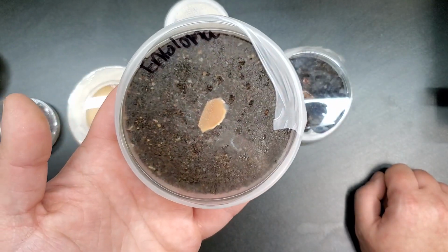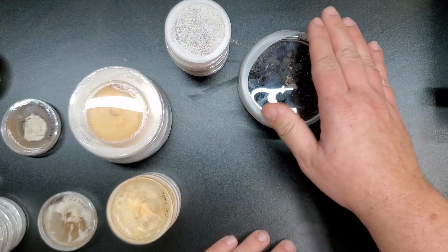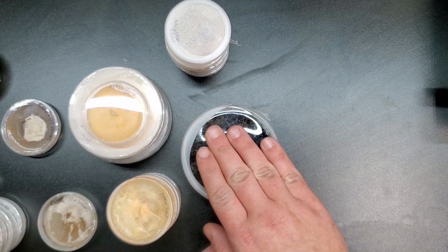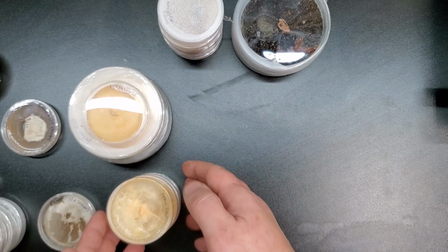And right here, this is the same deal, except this is an Entoloma culture sample that I just placed on here as well. I'm looking forward to seeing what these honey mushrooms look like growing on something like this compared to agar. It's going to take a while because they are slow growing, so I just got to be patient with those. I think that's it for the honey mushrooms.